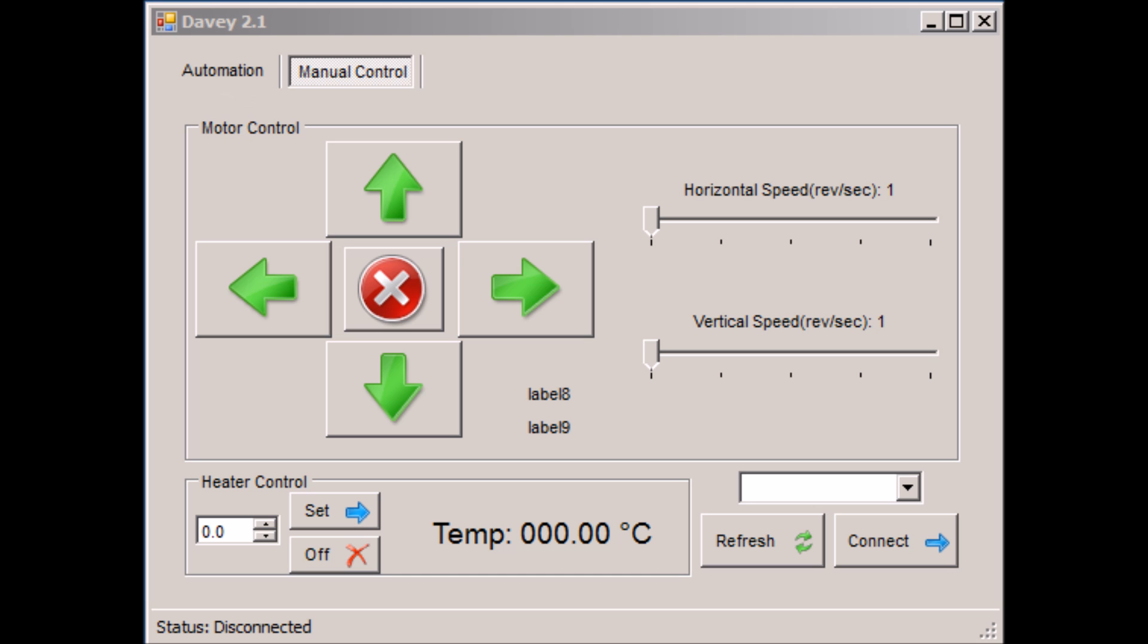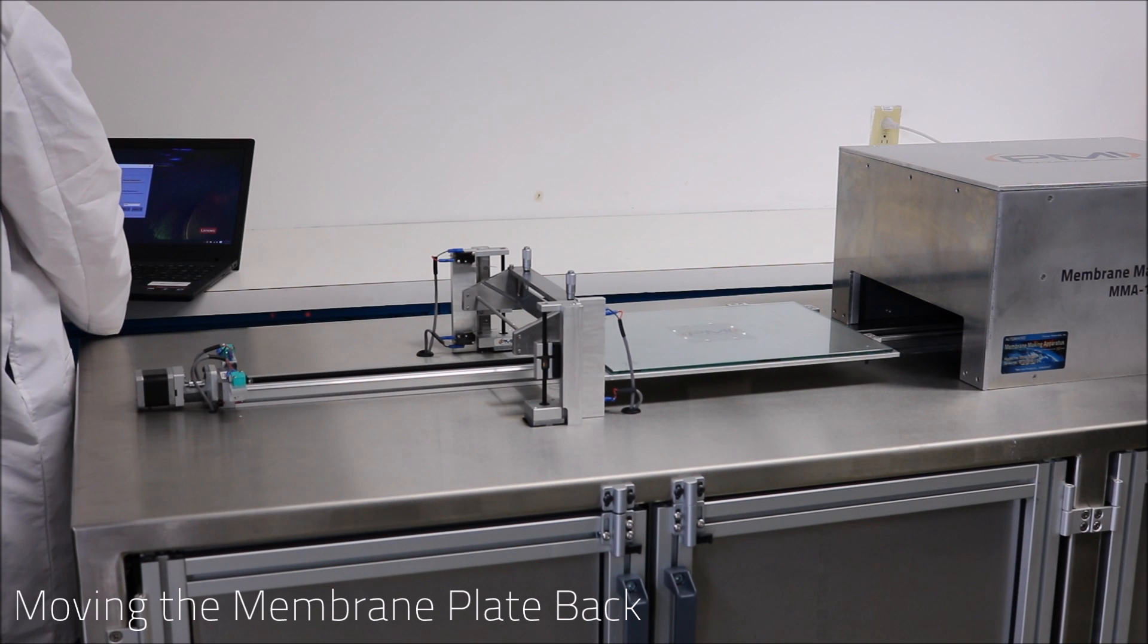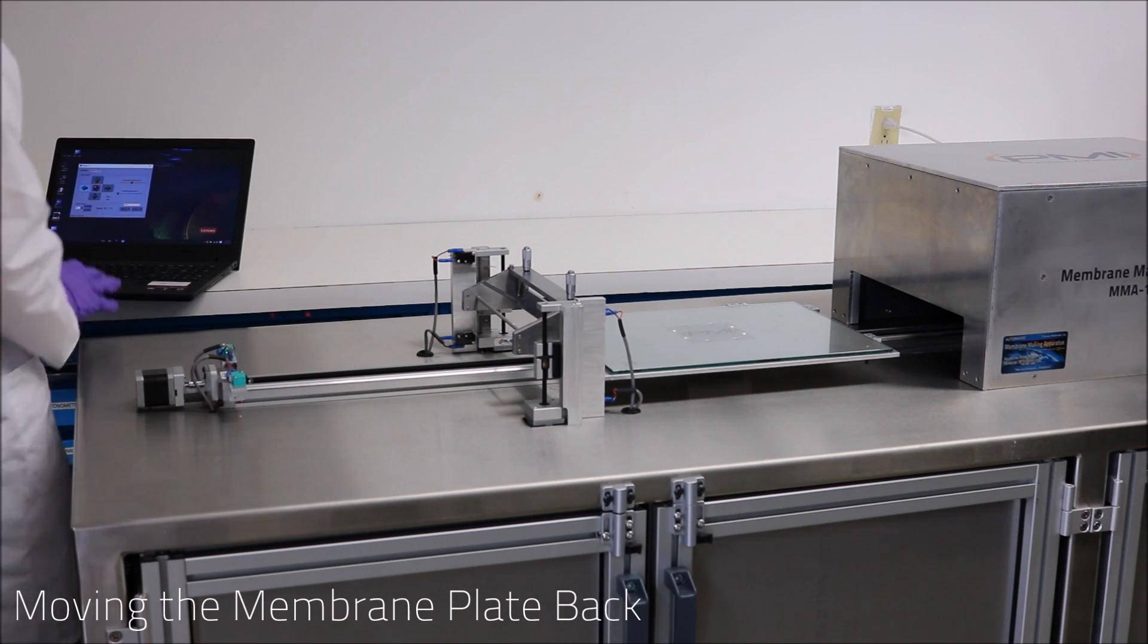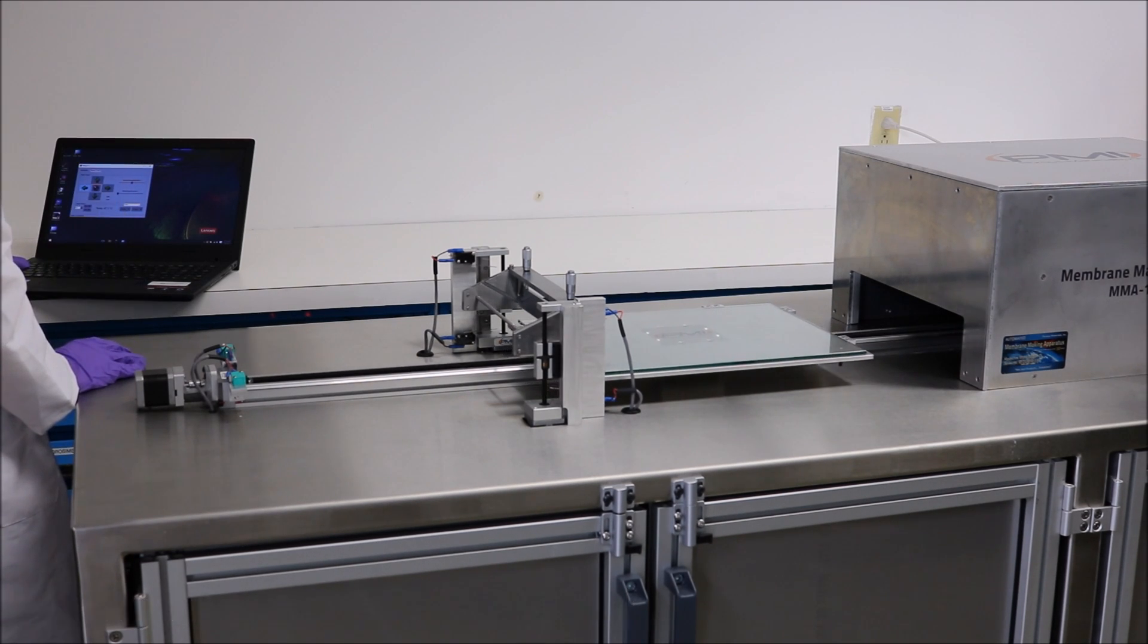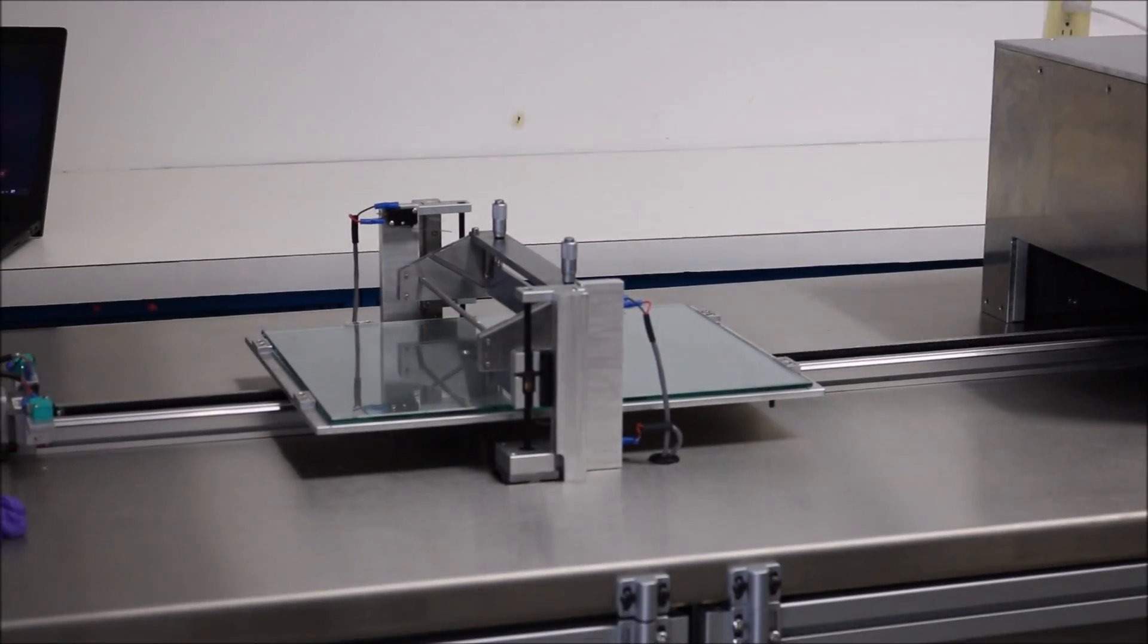Now we are going to back it up. After selecting the left directional key in the manual control, the plate should begin moving backwards. Make sure there is enough clearance under the doctor's blade so it does not scrape as it passes through. We want to back it up to about 2 inches from the end.